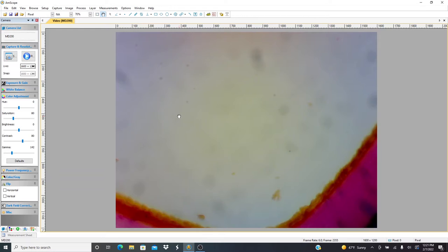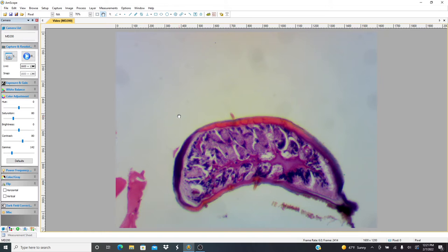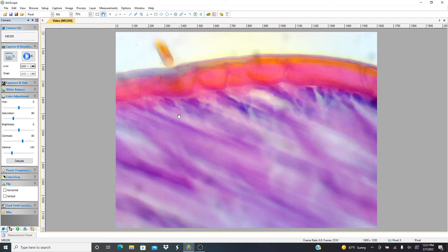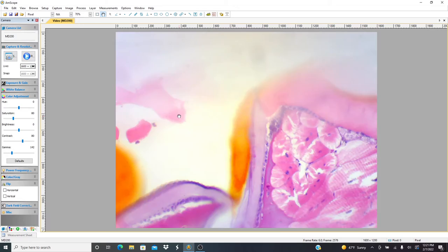I think this is another small section. Leg. I really wanted to get the legs, see some of those spikes coming off of there. I gotta say, my microscope setup is not ideal yet. I have to look at the screen, which is not the same as looking through the scope.